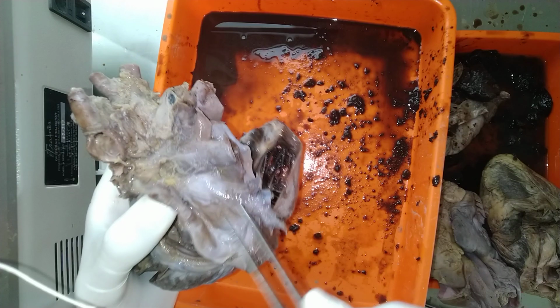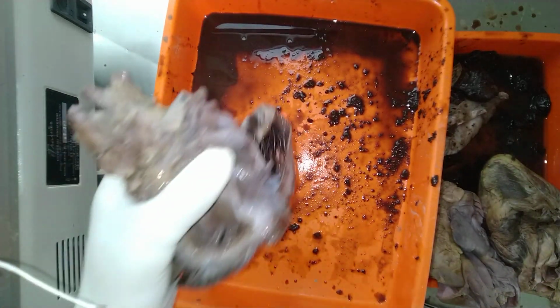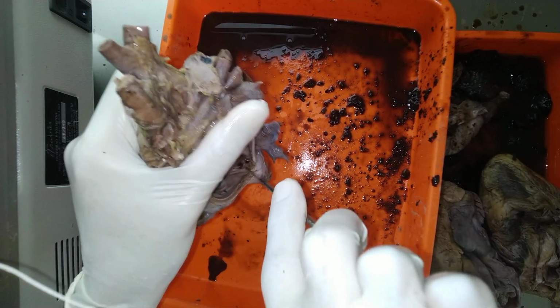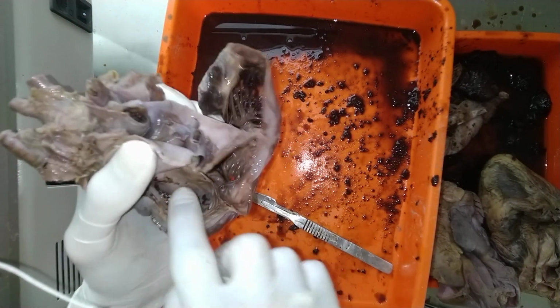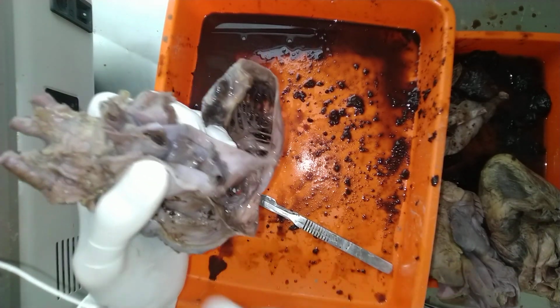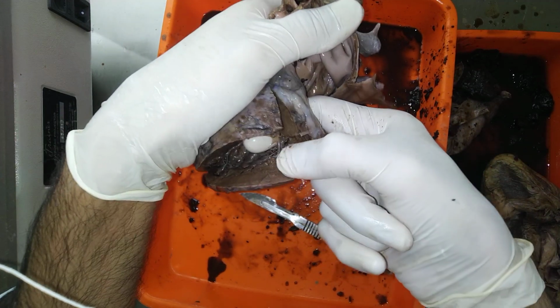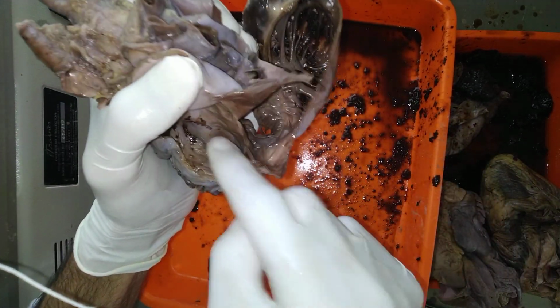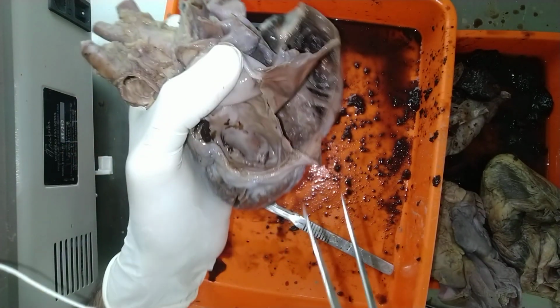So I have opened up the left atrium. So open it a little bit more. So here we see the bicuspid orifice. This is the bicuspid orifice that leads to the left ventricle. So the bicuspid orifice is guarded by the bicuspid valve, or it's also known as the mitral valve.